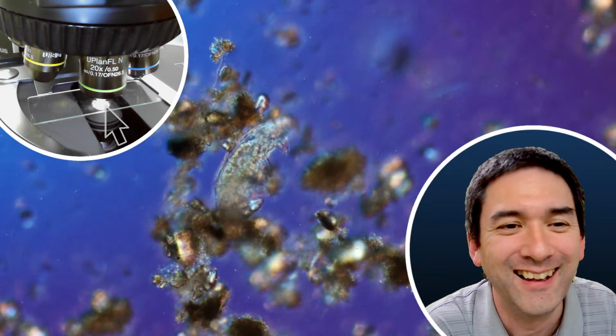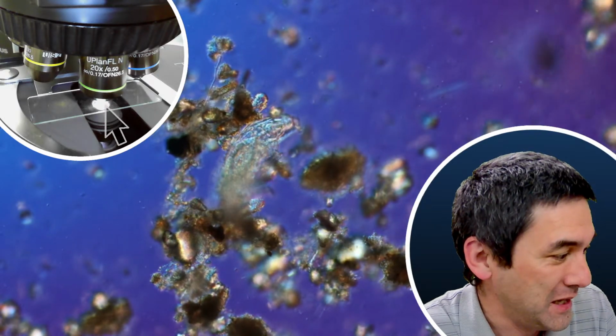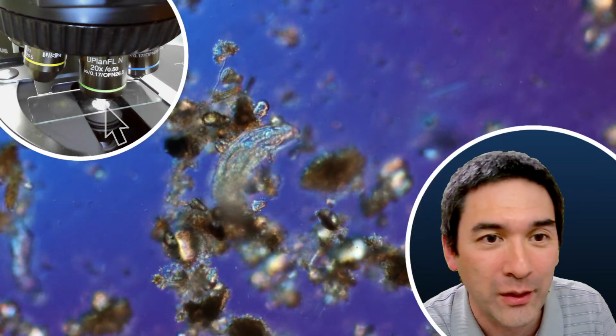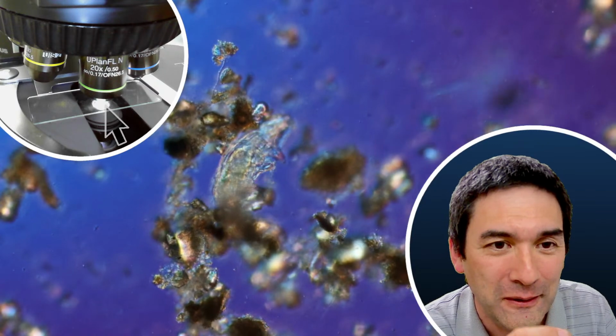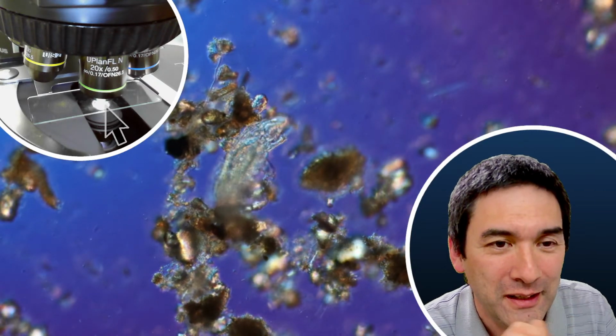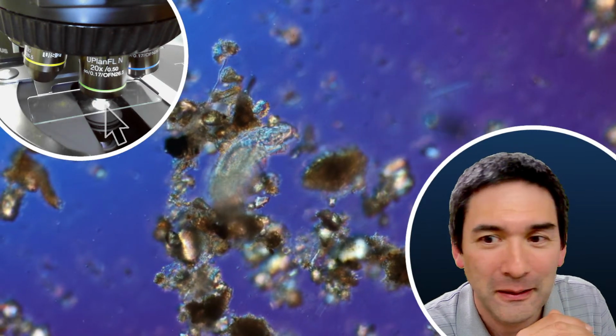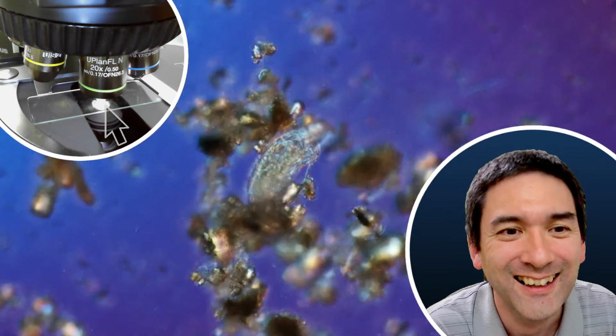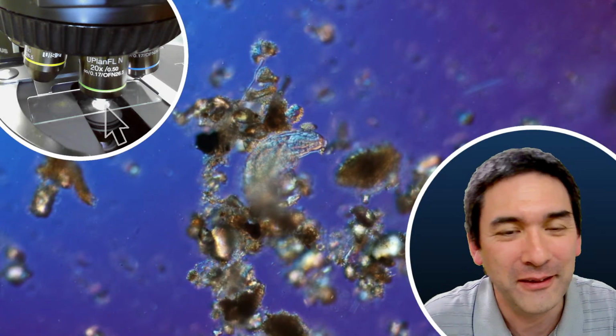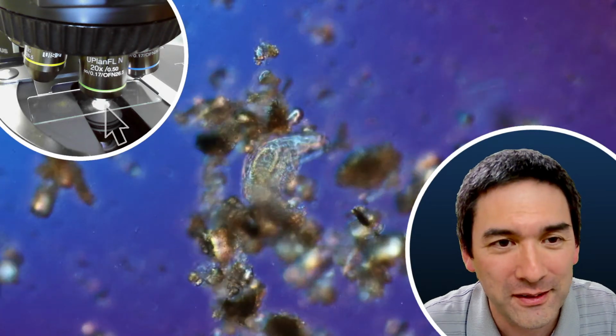Here's one. Without cover glass, okay? So that's really important. I cannot go higher with the magnification, otherwise I'm going to dip the objective into the water. And that's why it's a little bit blurry as well. Hooray! Success! Okay, now the evening has been saved.